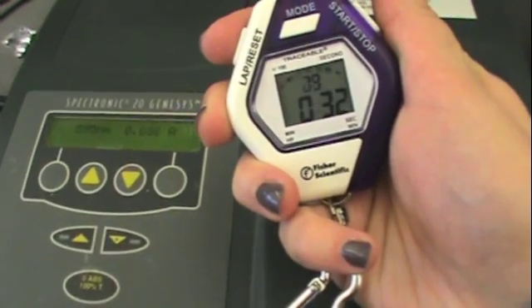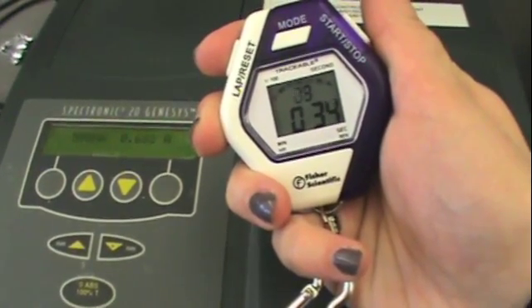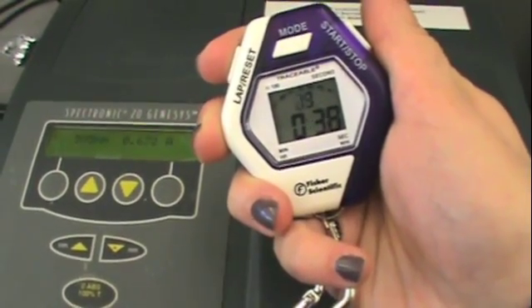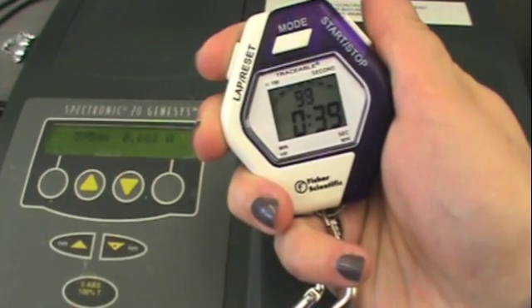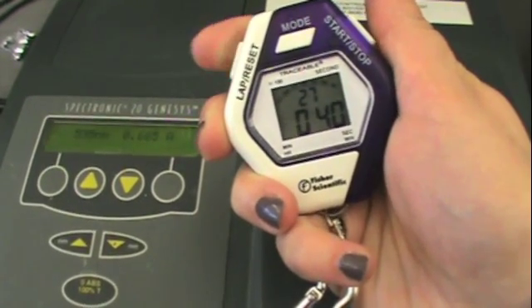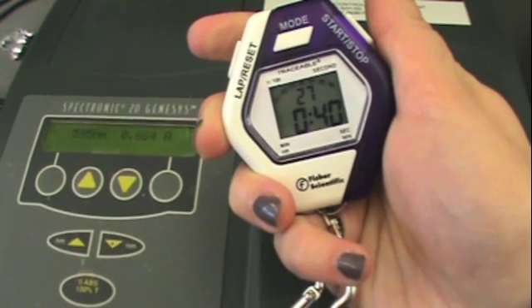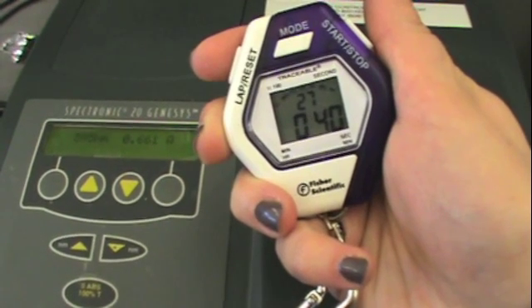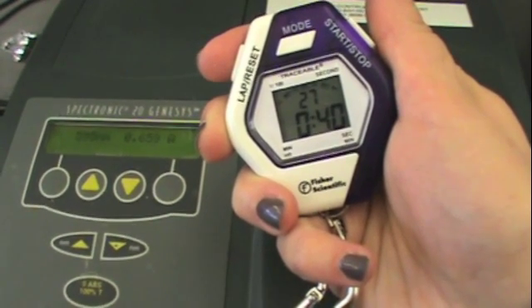And now we'll press it again when it reaches about 40 seconds. At 40.27 seconds the absorbance was 0.664, and we can record that and press the lap button again to continue timing throughout the entire experiment.